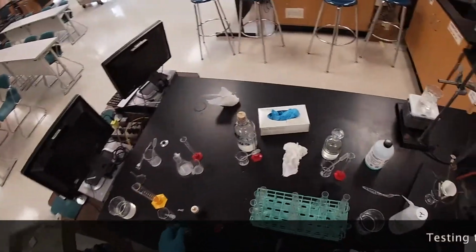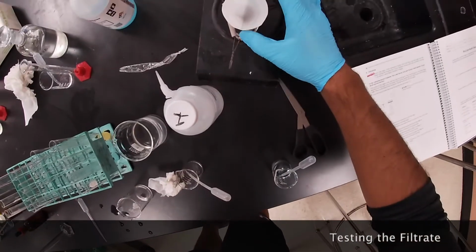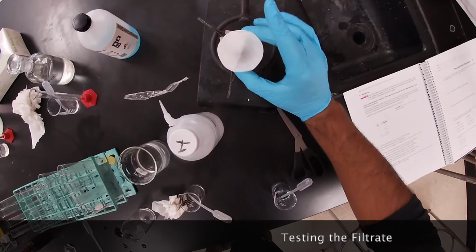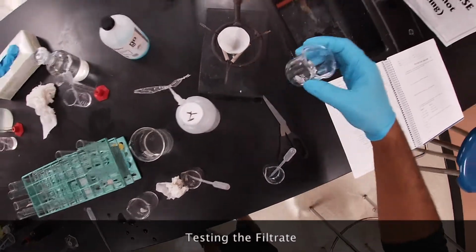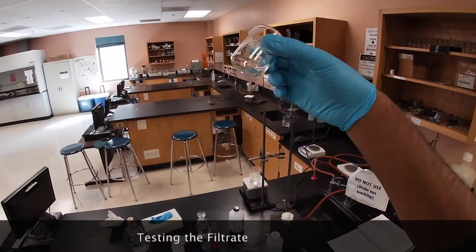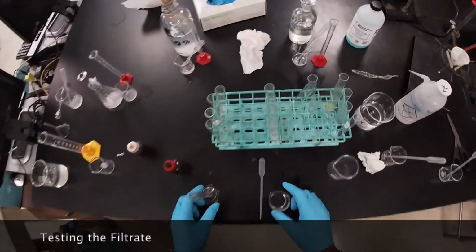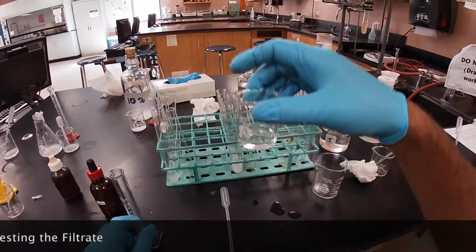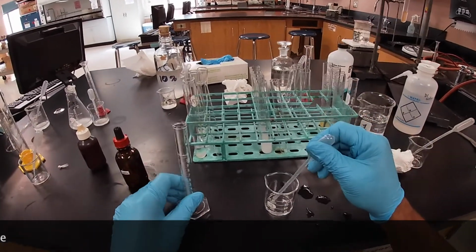All right, so the last thing that we're gonna do is, as you can see, our filtrate is already out, and we'll go ahead and check out right now the contents of the dry filter. This is all our filtrate, and as you notice, it is a lot clearer than what initially went in. Unfortunately, we're not going to have the ability to distribute 5 mLs into each container.